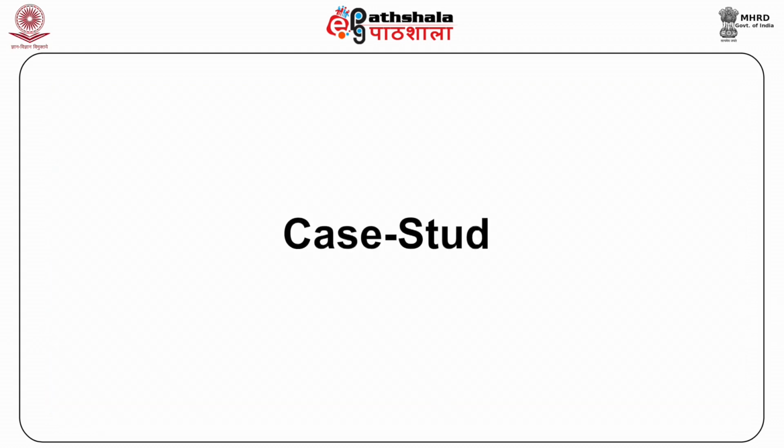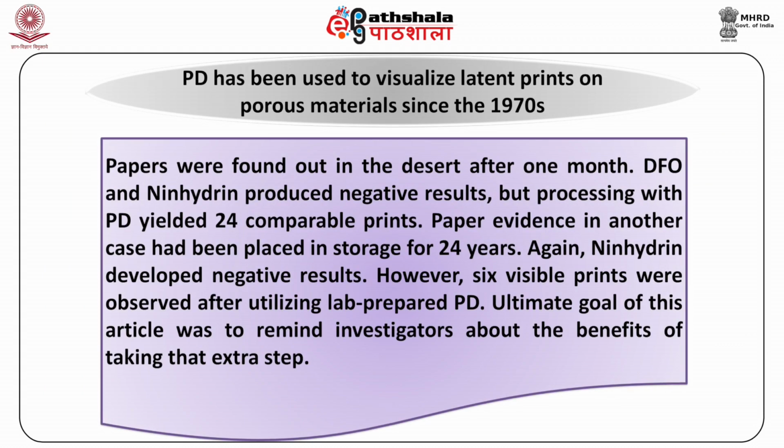Now, my dear student, let us see a case study. Physical developer has been used to visualize latent prints on porous materials since the 1970s. Recently, two local cases re-established the importance of this method. In one case, papers were found out in the desert after 1 month. DFO and ninhydrin produced negative results, but processing with physical developer yielded 24 comparable prints.